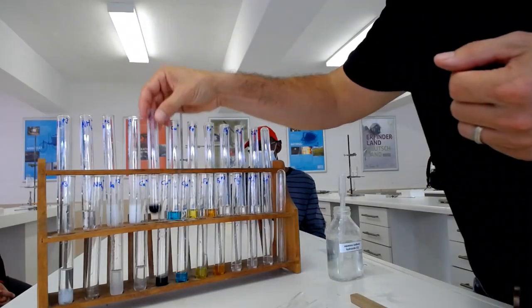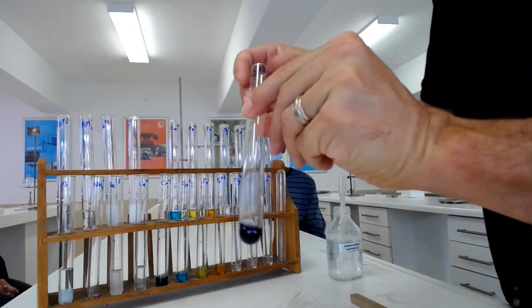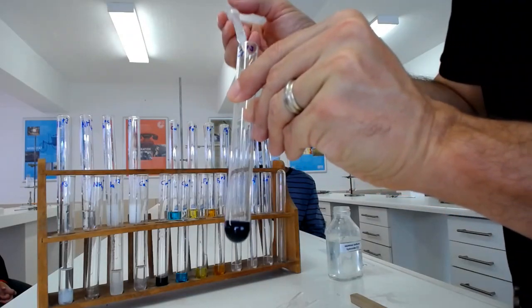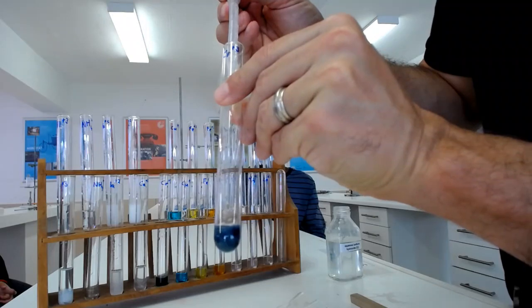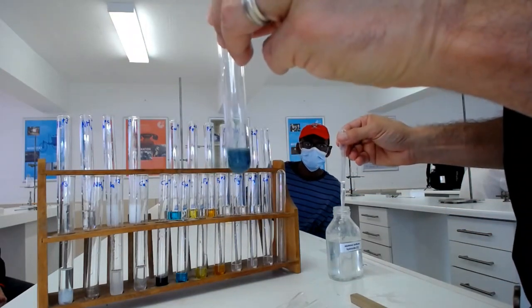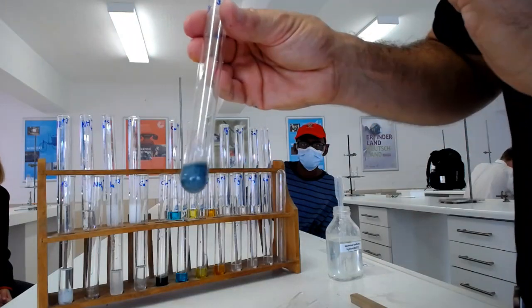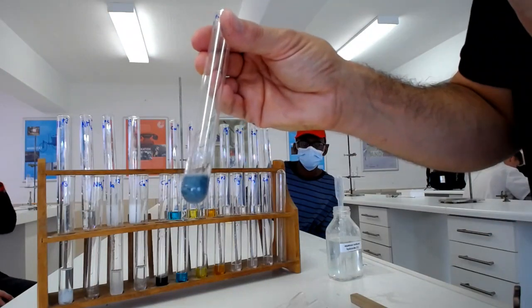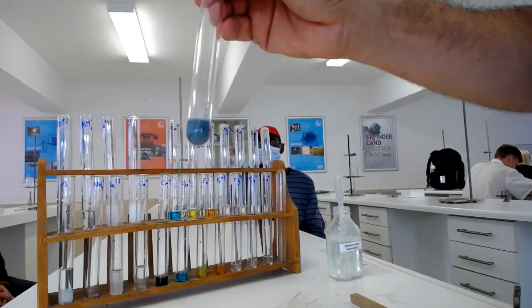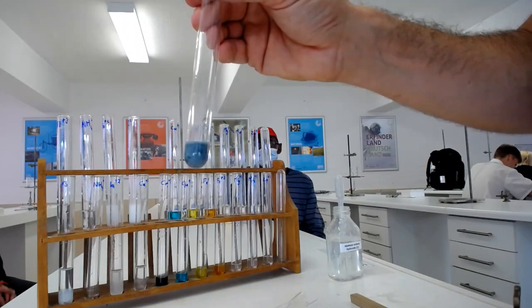All right, chromium. Now, what does it say for chromium? What happens with my sodium hydroxide? Gray-green precipitate. Look at that. There is a gray-greenish precipitate in there. And what happens if I add excess? It's soluble.